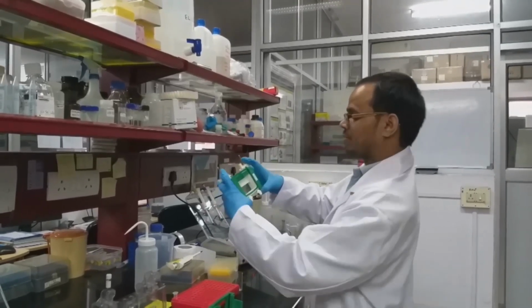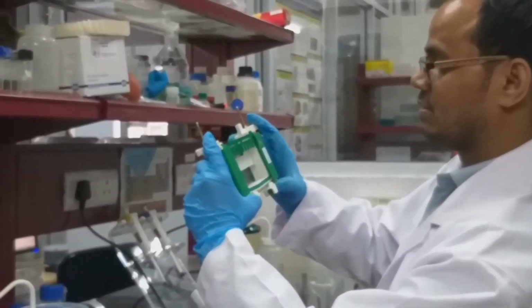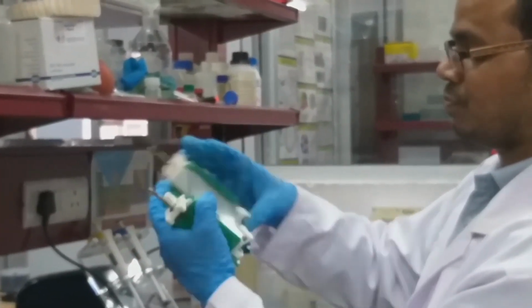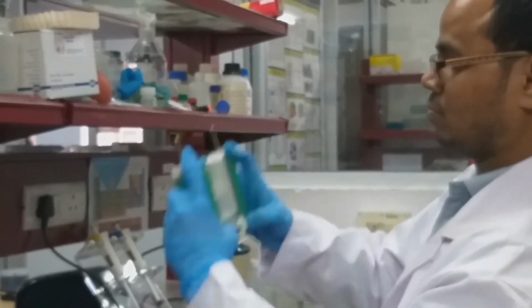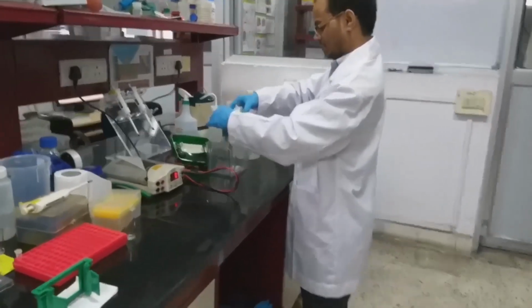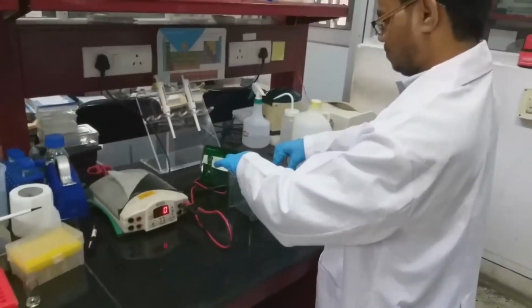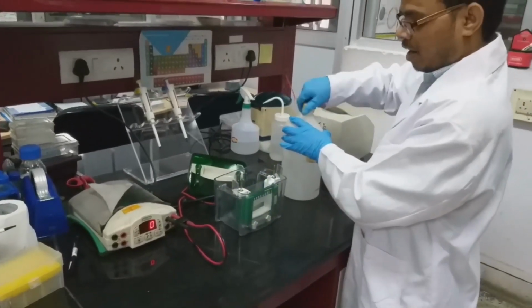After that, gradually adjust the gel length. So we just have to fix it like this. Once fixed here, we have to add the running buffer.